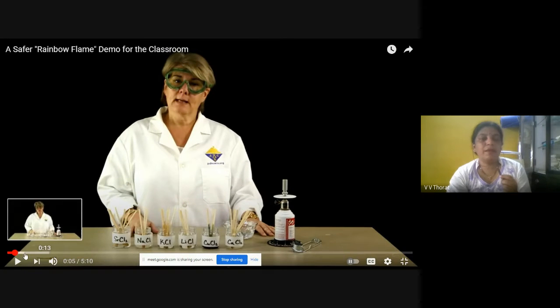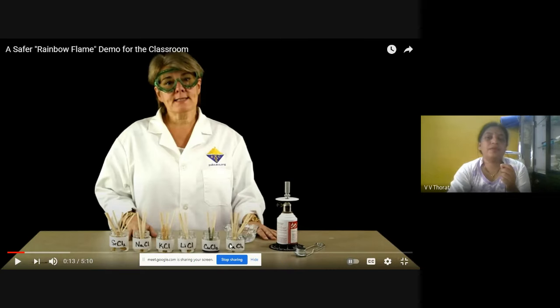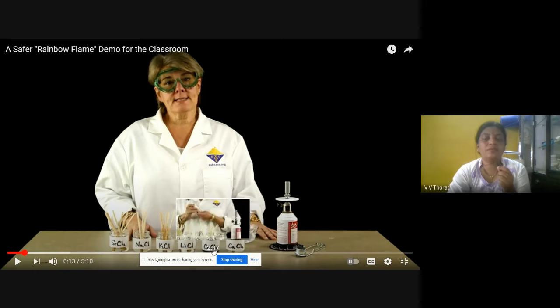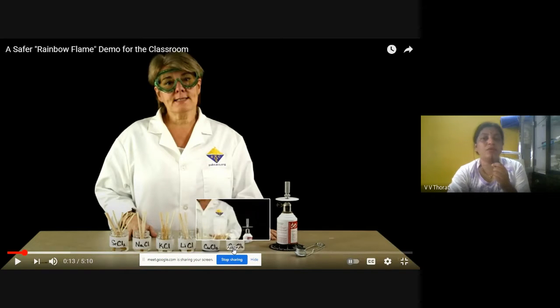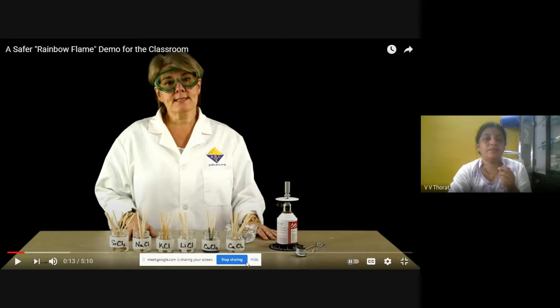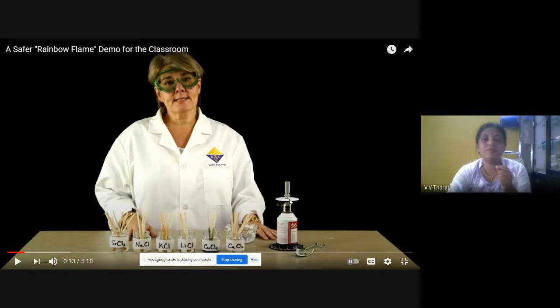So this madam is going to show us the flame test. See, she has taken all the metallic salt solutions, and they are in chloride form: calcium chloride, copper, lithium, potassium, sodium, and strontium chloride. Now from the color of the flame, we can identify whether calcium, copper and so on are there, and you can see the color of the flame also.